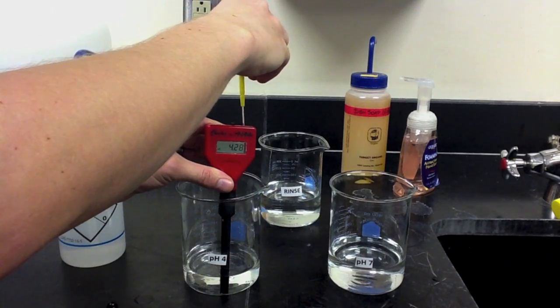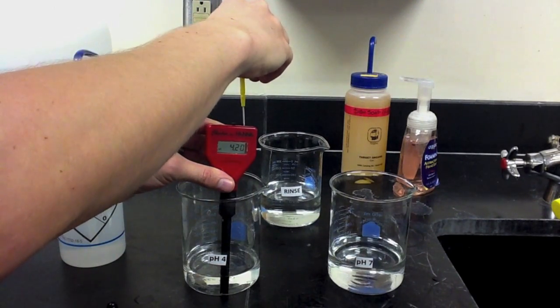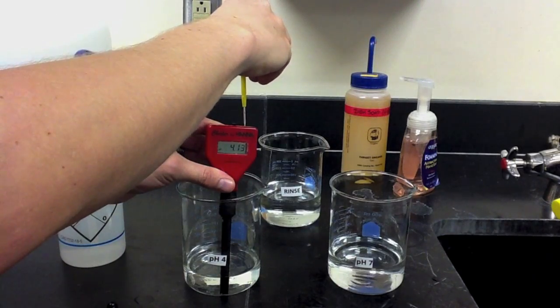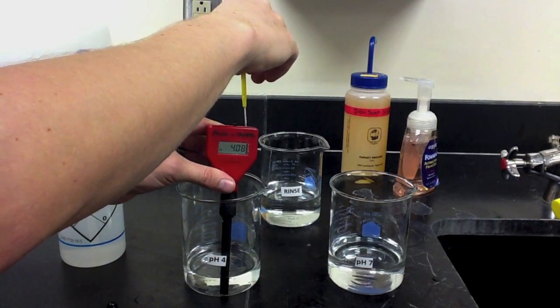Once we've obtained it at 4.00, our pH meter is now calibrated and we're ready to use it to measure the pH of an unknown solution.